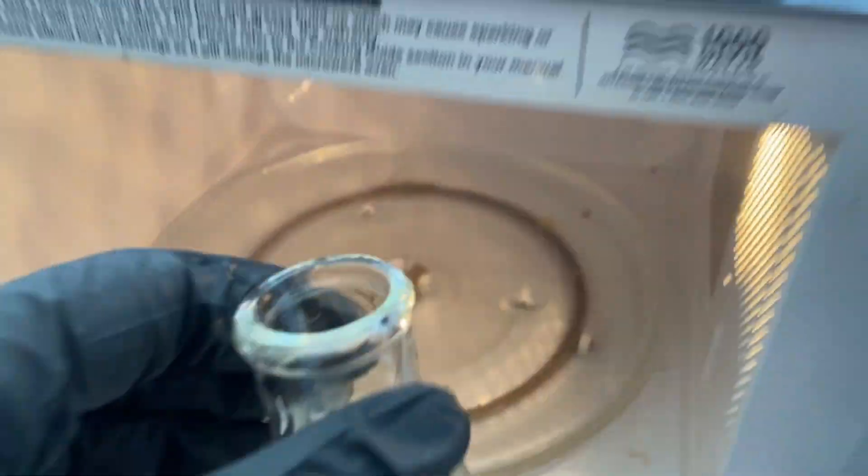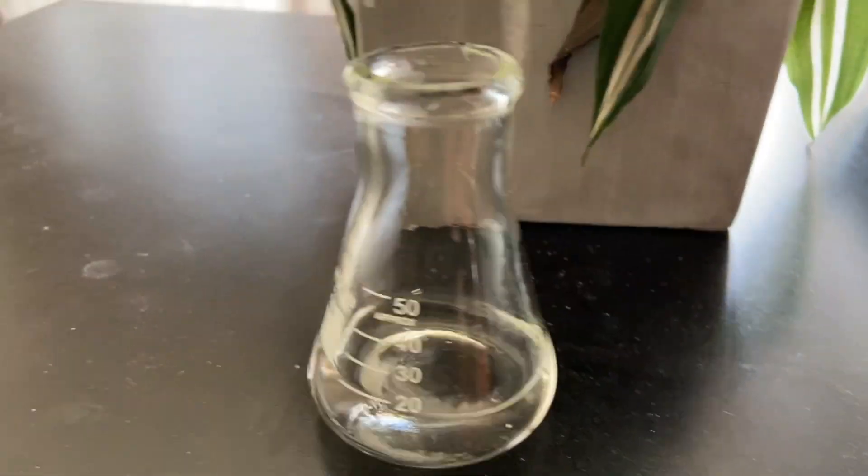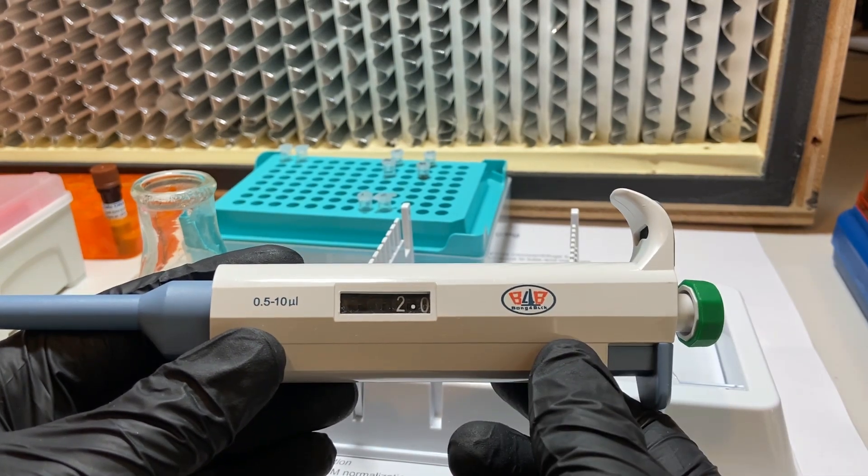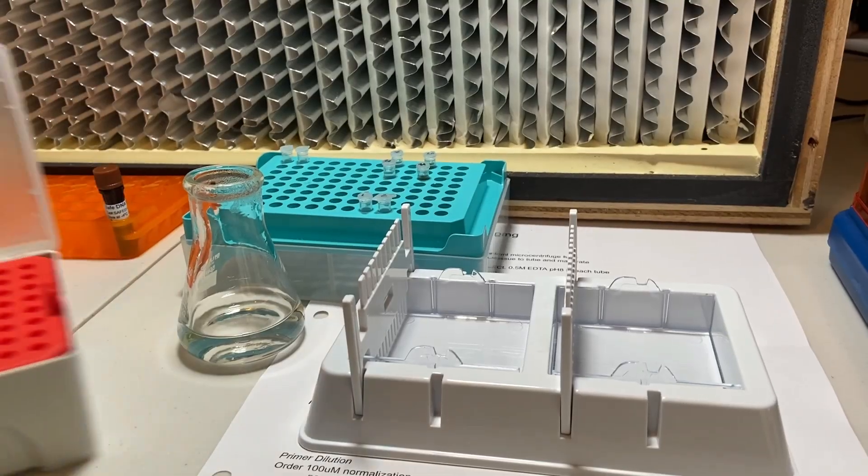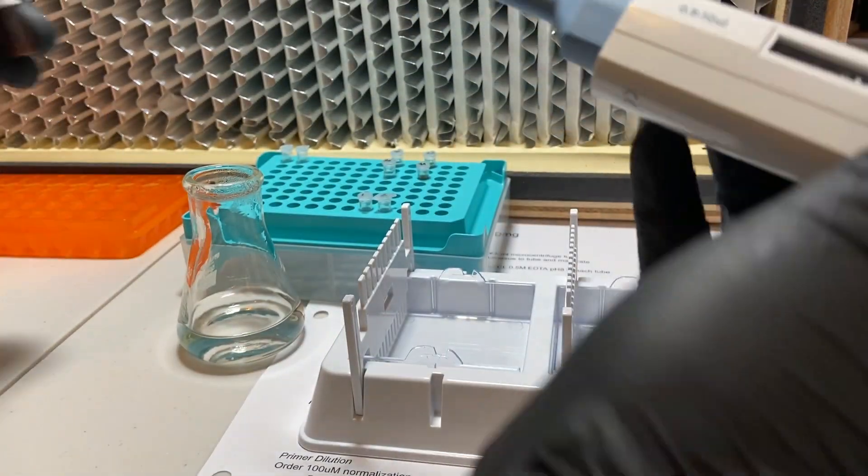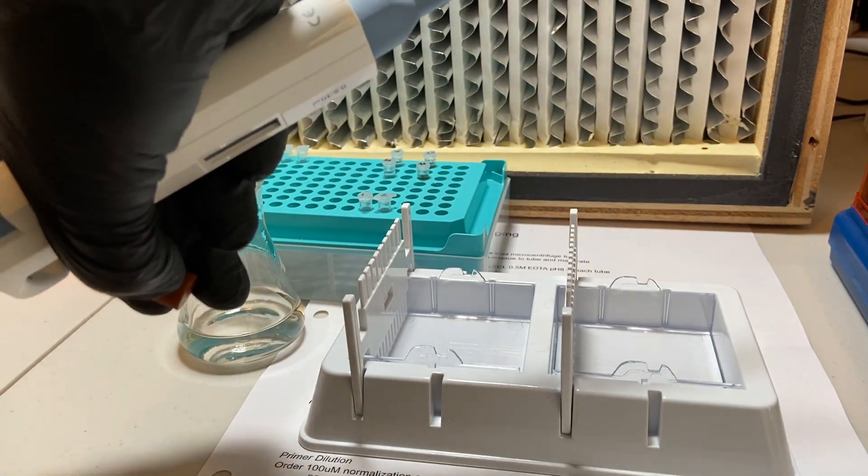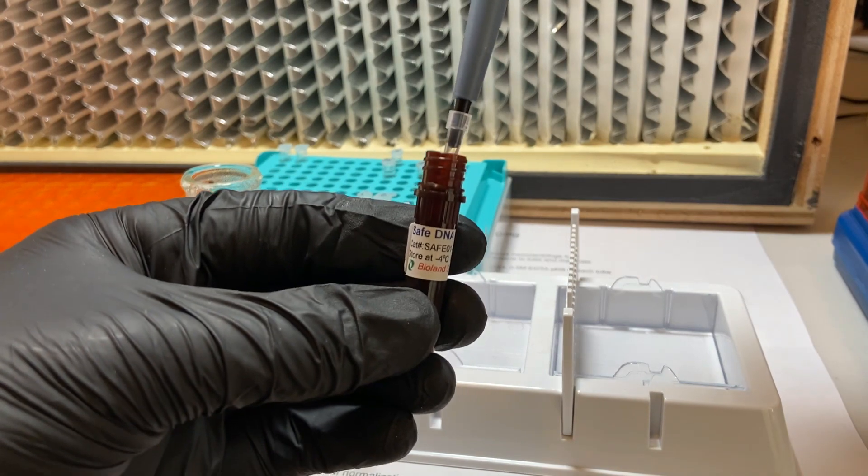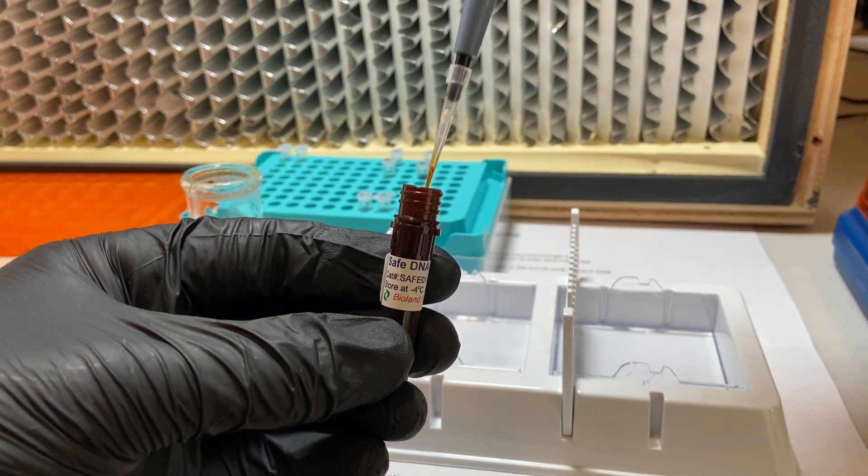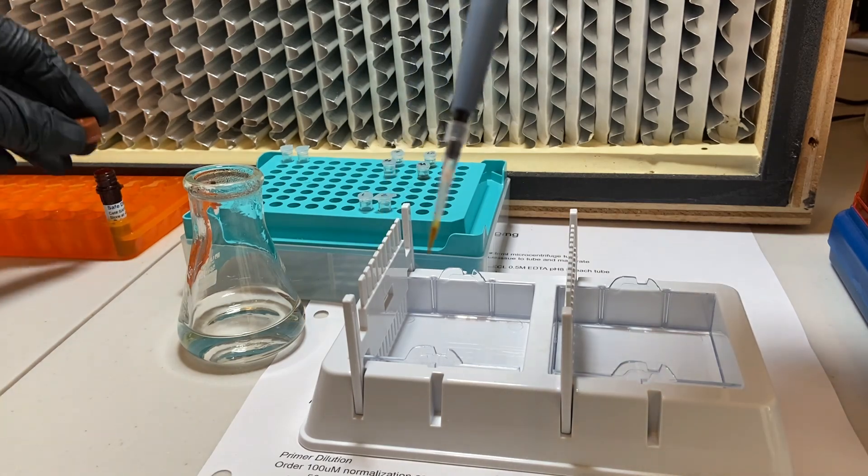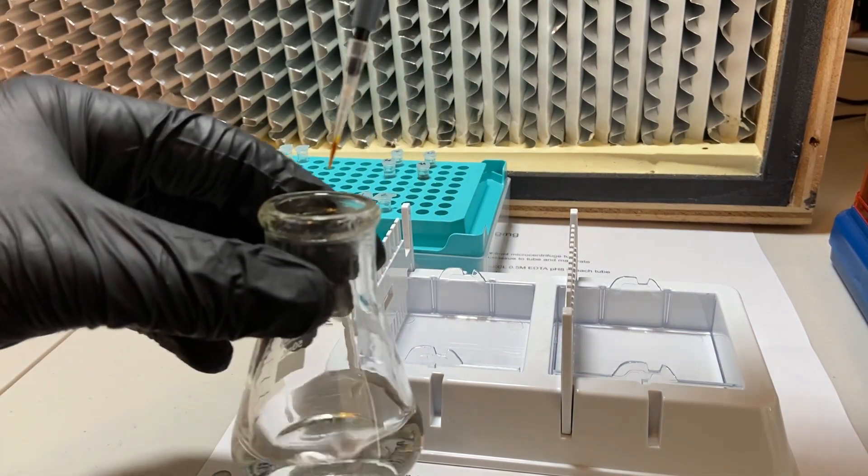After microwaving the gel for 30 seconds, it should all be melted. The next step is we need to add DNA stain so that when we add the DNA to our gel, the stain will bind to the DNA and cause it to fluoresce. So in this case, we're going to add 2 microliters of 10,000X gel stain to the gel after it's had a little bit of time to cool. You don't want to add it right away. Wait a couple of minutes for it to cool.